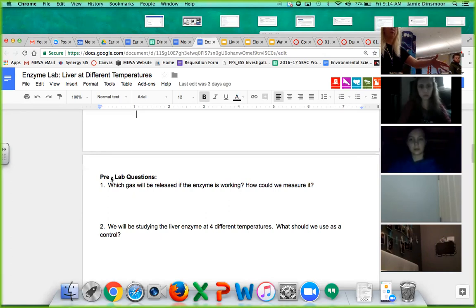The liver, we're going to try to have it the same size, right? We can use the same thermometer. I have 2 of them here. And we'll pick whichever one is the best.